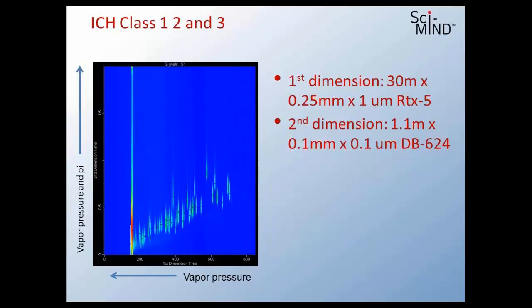This is a first chromatogram, and you can see here that this is actually now what we're doing. If you're not familiar with this, we're actually looking down on a 2-dimensional chromatogram. So the bright spots you see there are your peaks. You can see retention time on the bottom, and then another retention time on the top, because what we're going to do is take one column, shoot our samples down the one column, which is a traditional column, then we're going to rapidly inject them onto a second column in tandem.